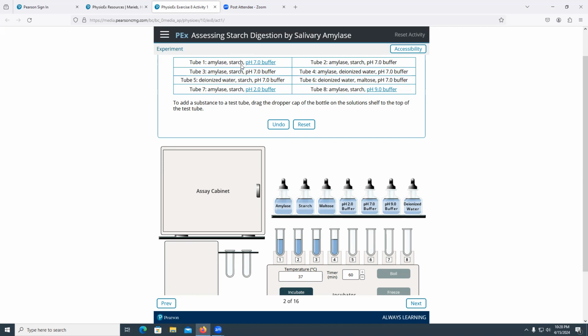What's going to happen here is that, because remember we're testing temperature also, if the temperature is optimal, I will have both colors. The yellow color turning into black for my IKI because I do have a reactant. And once they both interact in the test tube at that optimal temperature, I will have a considerable amount of product, being the maltose and glucose. And the color of my Benedict now will increase. It will change from blue into green, into orange, into red, meaning there is so much sugar, so much product that has been made, reflecting that we are now at optimal temperature.